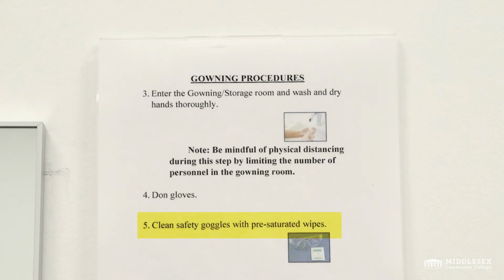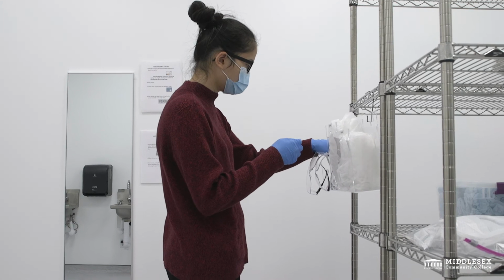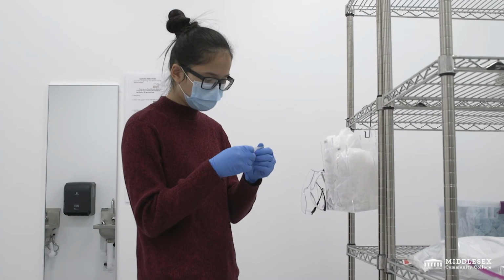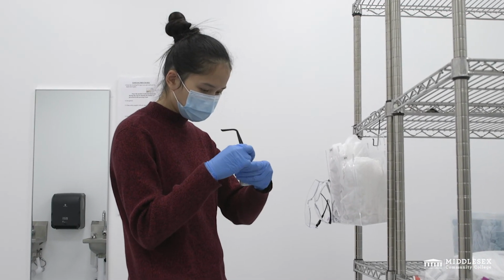The next step requires you to clean safety goggles with the pre-saturated wipes that are available. If you wear glasses, your glasses should also be cleaned with pre-saturated wipes.